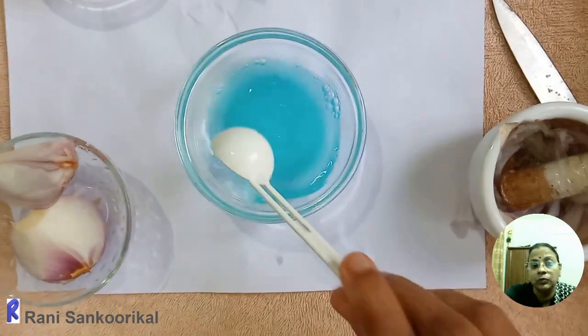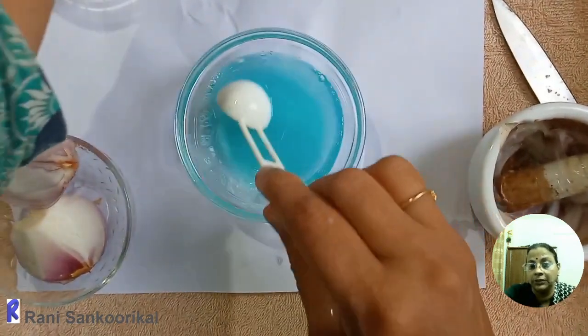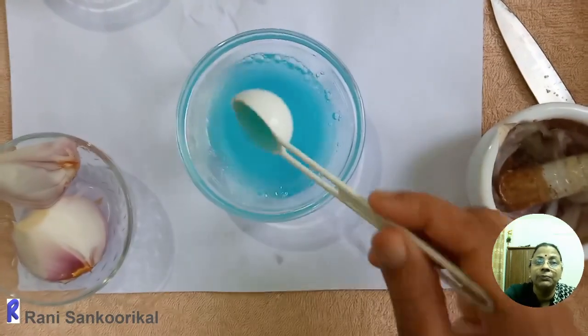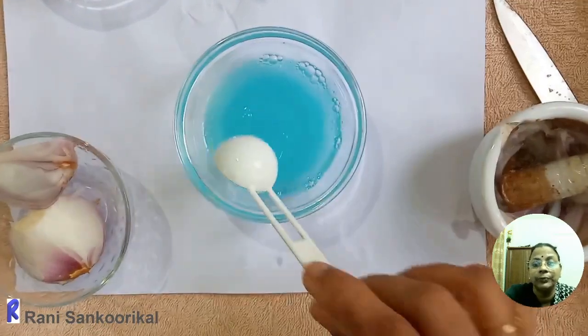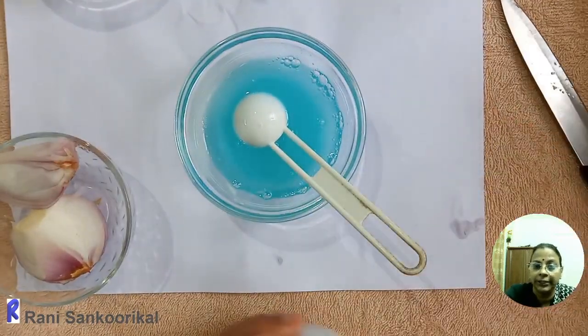While adding water and stirring, you have to make sure that there should not be any bubbles, because quite naturally the bubbles will be there, and those bubbles should settle down and you have to break all the bubbles, otherwise it will interfere with the filtering of the DNA.